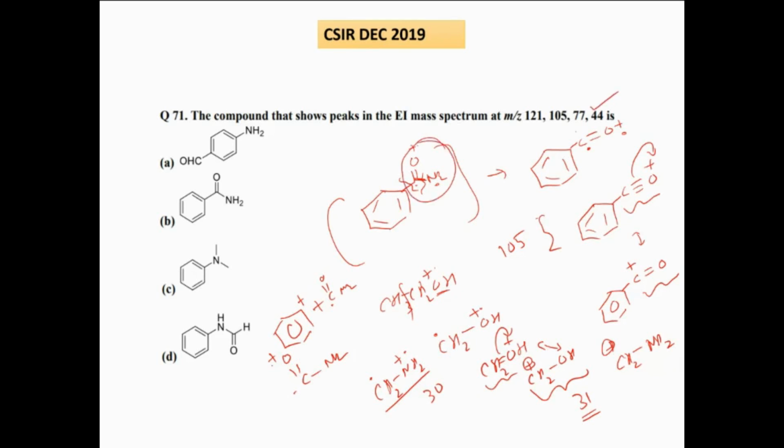44 நாளே ஞாபகம் வச்சுக்கோங்க. இந்த compoundல they have not given the McLafferty, the aldehyde McLafferty undergo பண்ணாது. So 44 னா aldehyde McLafferty ஆக இல்லனா CONH2 ஆ இருக்கலாம். 45 னா acid ஆ இருக்கலாம், carboxyl. 29 னா formyl cation. 43 னா acetyl cation, COCH3. இதெல்லாமே clues. Acid na 45, CONH2 na 44. These all are some simple clues.